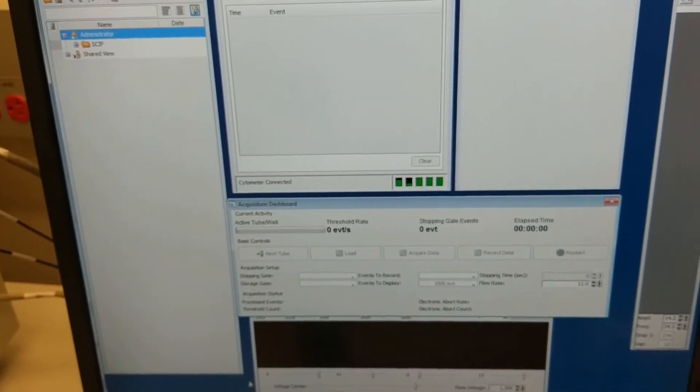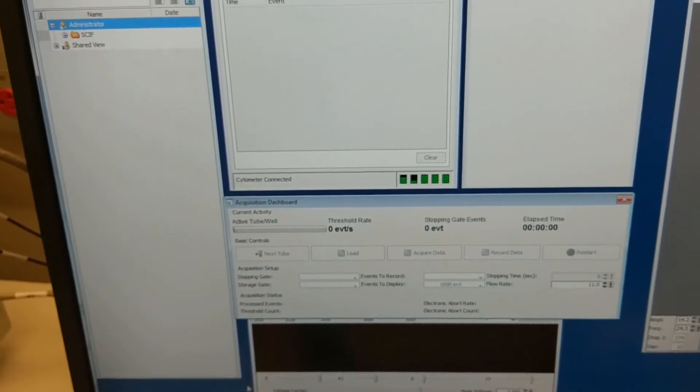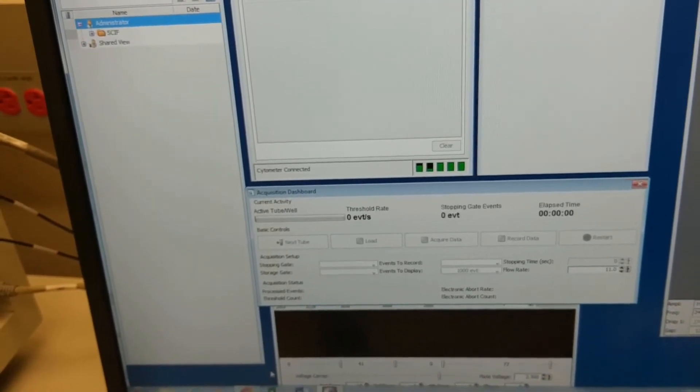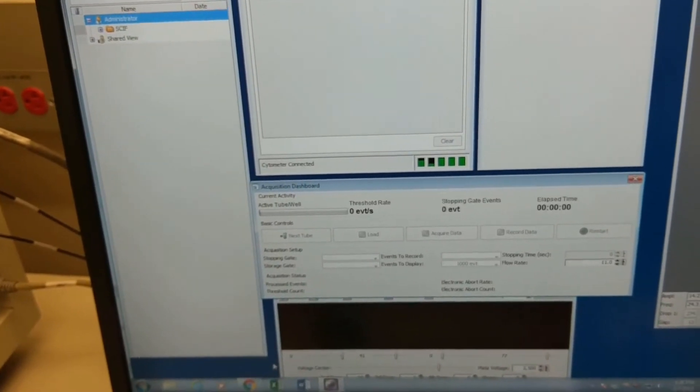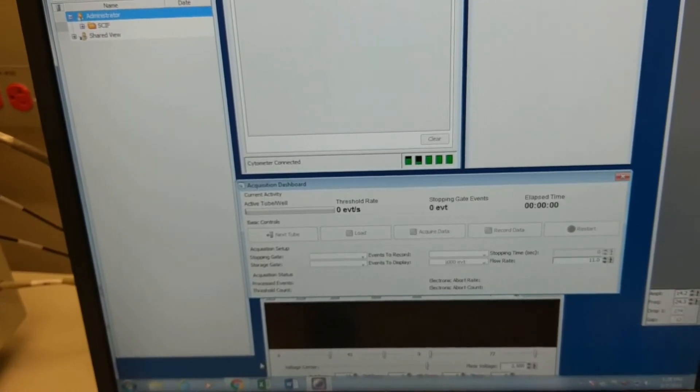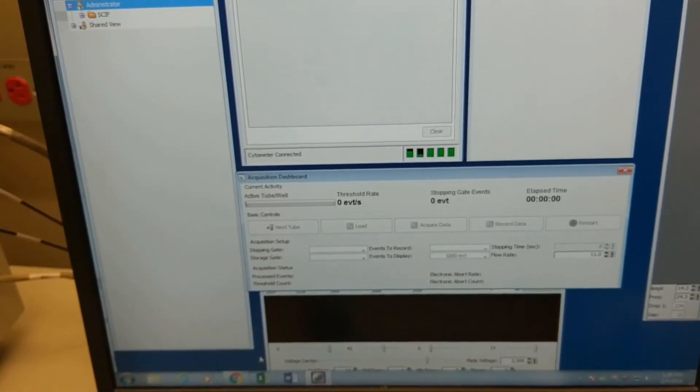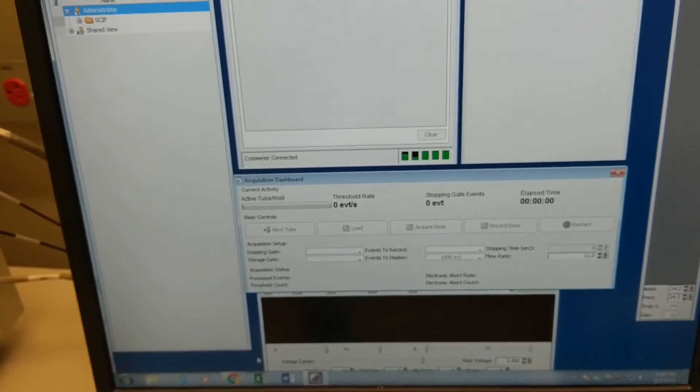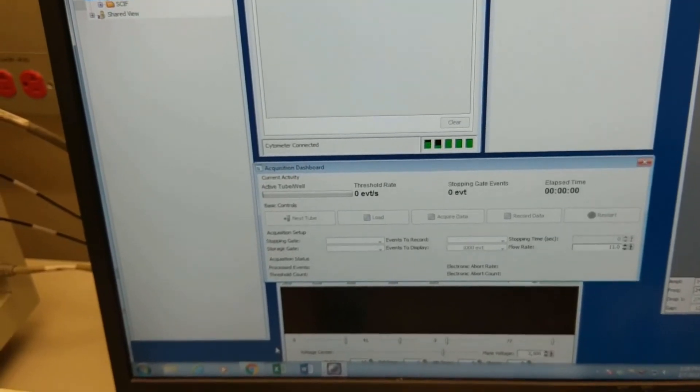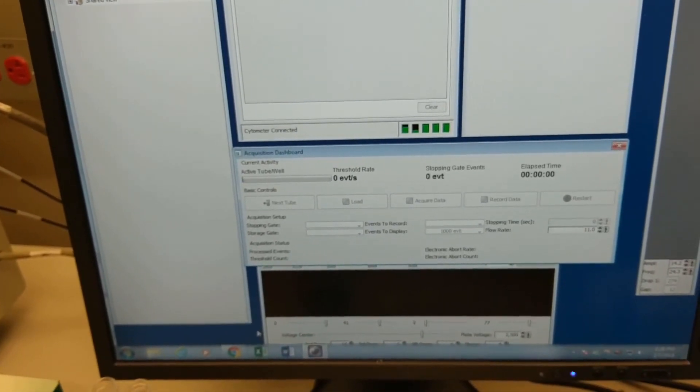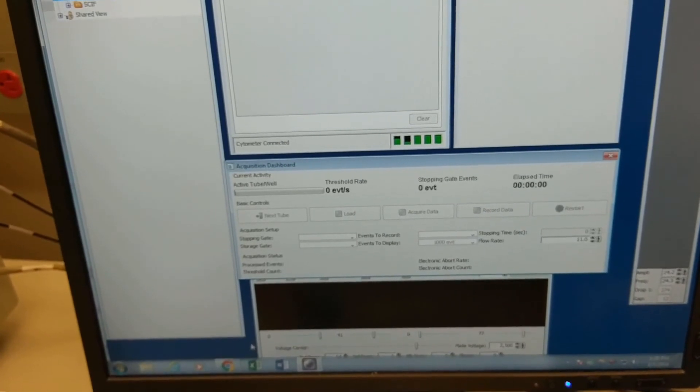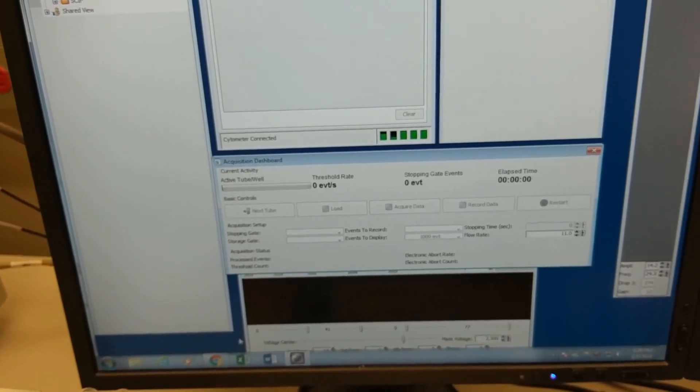And those sensors cost about $200 new from BD, and so I found that it's just not worth it. Those tanks almost never actually go empty on me because I change them once a month when I sterilize the instrument. So I never run low on water or FaxClean or ethanol.